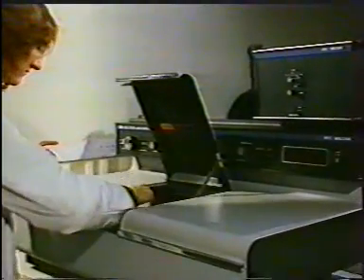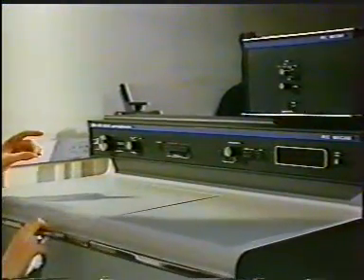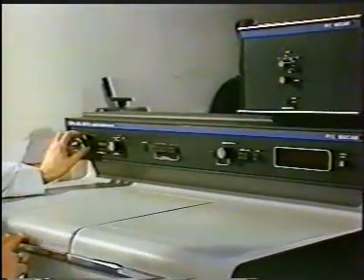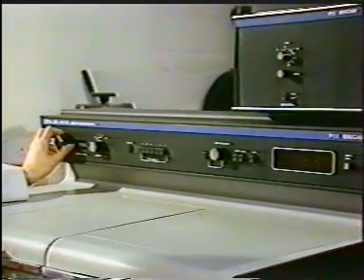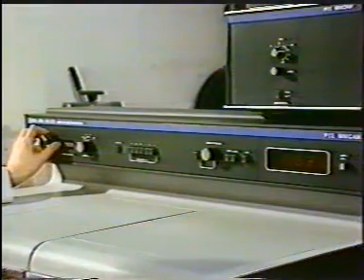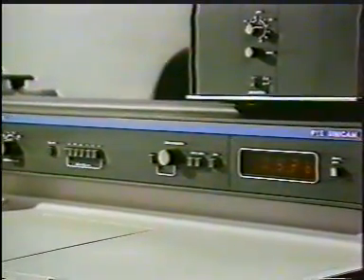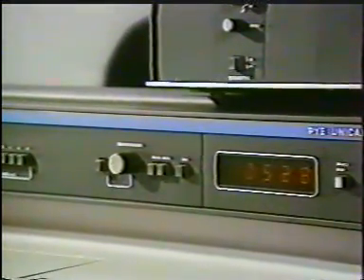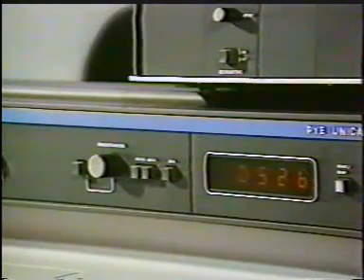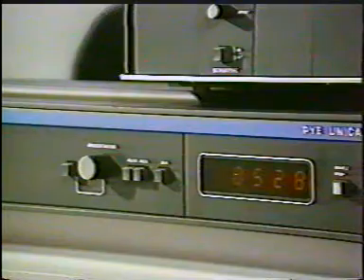Where possible, a quantitative assay is carried out on the raw material. This may take the form of a titration or determination of the ultraviolet light absorption or some other suitable method. However, a material which gives a satisfactory assay result may still contain a variety of impurities in small or trace quantities, and it is usually necessary to set limits on some of these impurities and to carry out tests for them.